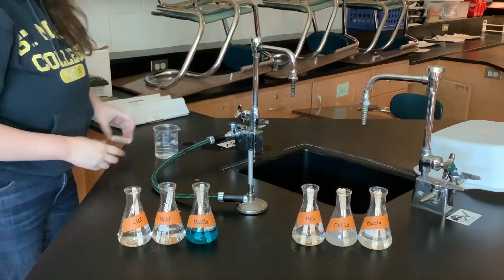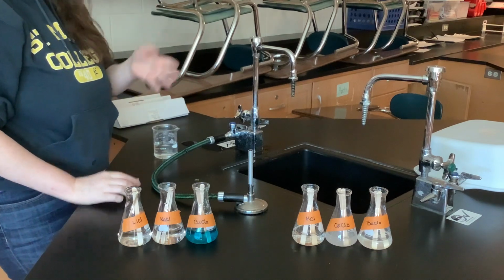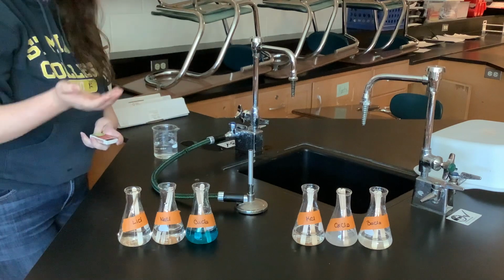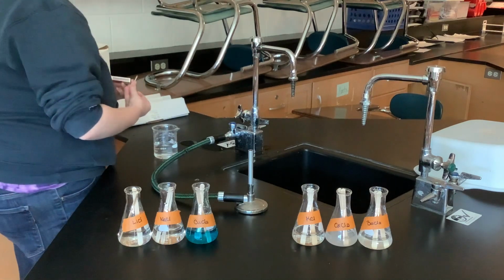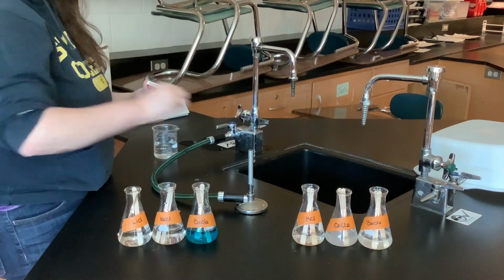So let's get started. I also have a beaker of water back here, because I don't want anything to burn for too long. Once it burns a little bit, I'll be putting it in the beaker of water to make sure we don't, you know, set the school on fire. So I'm gonna turn on my Bunsen burner.